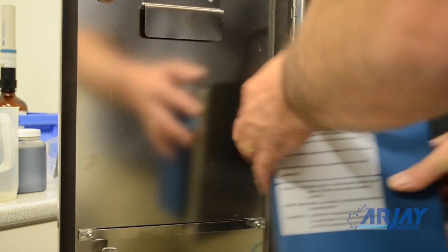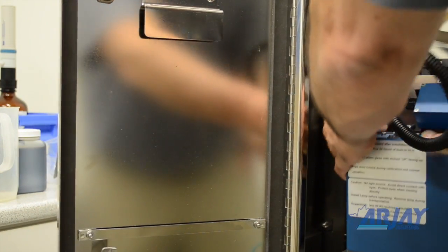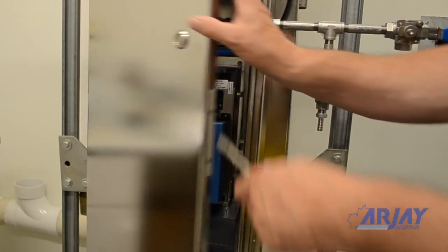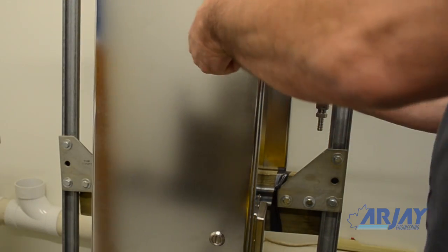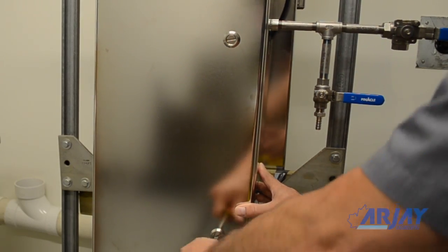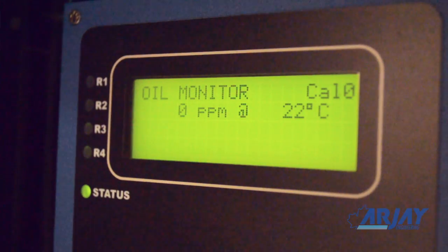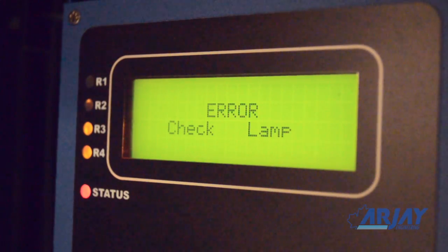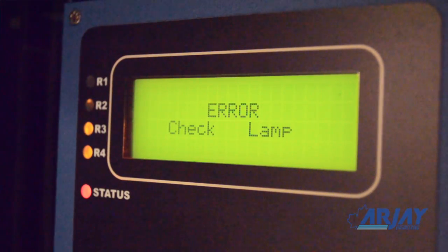Replace the lamp box and close the door. The unit is now back in operation. It is recommended to check the unit daily when first installed and reduce the frequency of checks until an appropriate schedule has been determined for your site conditions. As the lamp degrades, it will eventually reach a level that activates the maintenance relay and displays a lamp failure warning.